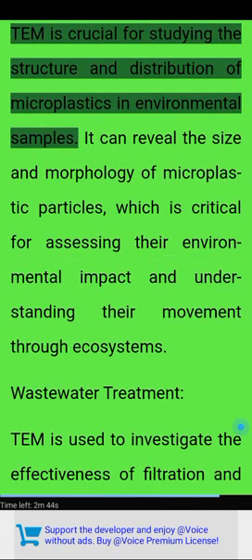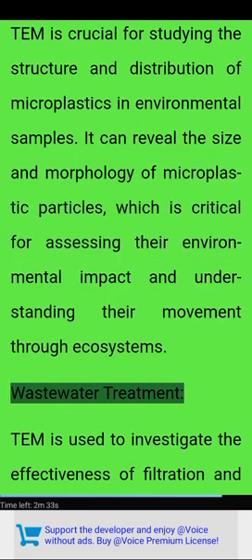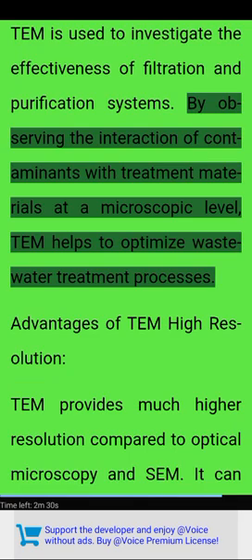Microplastics research. TEM is crucial for studying the structure and distribution of microplastics in environmental samples. It can reveal the size and morphology of microplastic particles, which is critical for assessing their environmental impact and understanding their movement through ecosystems. Wastewater treatment. TEM is used to investigate the effectiveness of filtration and purification systems. By observing the interaction of contaminants with treatment materials at a microscopic level, TEM helps to optimize wastewater treatment processes.